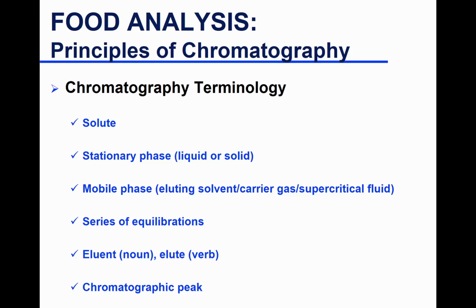Okay? And then once everything has interacted with the column, you change the concentration of your mobile phase and you add some organic solvent in there. Then your compounds are going to start moving and leaving the column. We'll talk more about that when we cover strengths of the mobile phase and what it means. But definitely, depending on your stationary phase, you will start off with different combinations of mobile phases. So they will be different based on what you have. Okay.